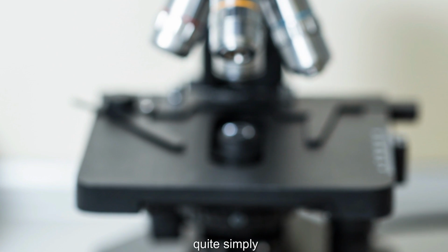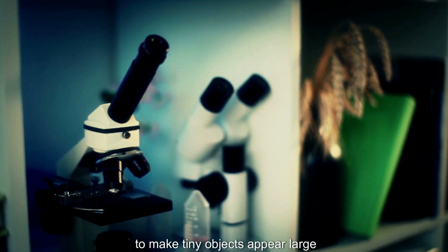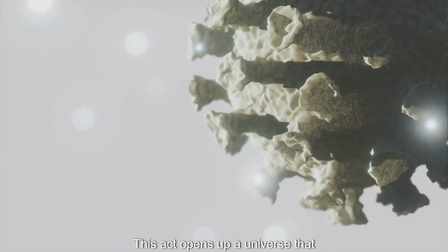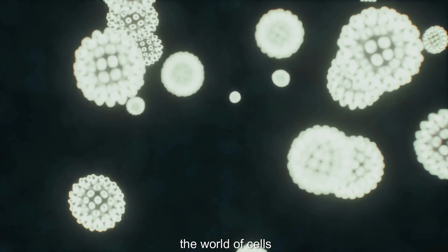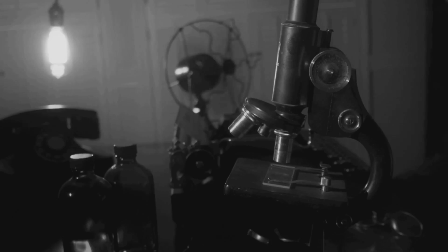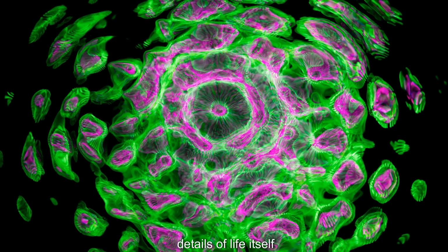Microscopy is, quite simply, the art of seeing the very small. It is the use of an instrument, a microscope, to make tiny objects appear large enough for us to study. This act opens up a universe that is completely inaccessible to our unaided eyes. Without it, the world of cells, bacteria, and viruses would remain entirely unknown. Microscopy is our bridge to this invisible realm. It allows us to see the fundamental details of life itself.